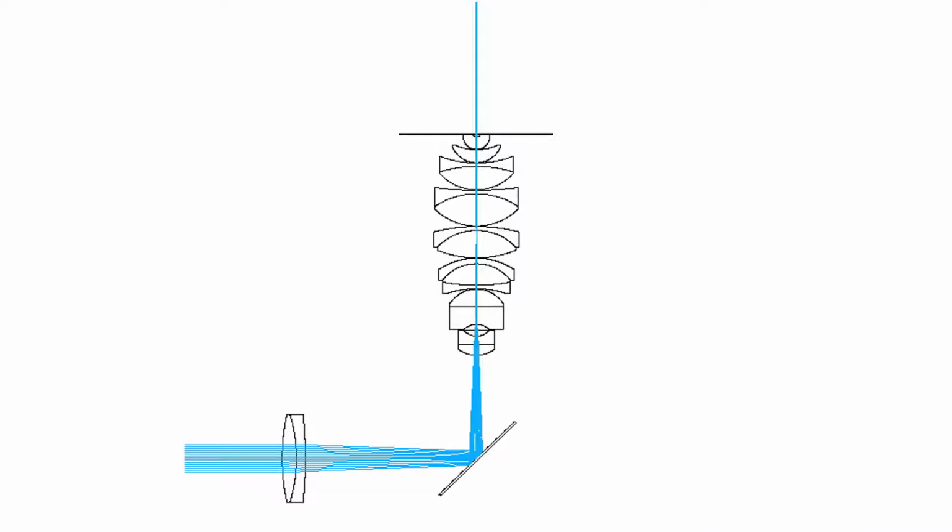So, coming back to the ray tracing model, if I now insert another simple lens into the optical pathway of the laser beam, such that the light focuses down onto the objective lens back focal plane, instead of a tight focus emerging from the objective, I now achieve a thin, tightly collimated beam pointing straight out of the top of the objective lens.